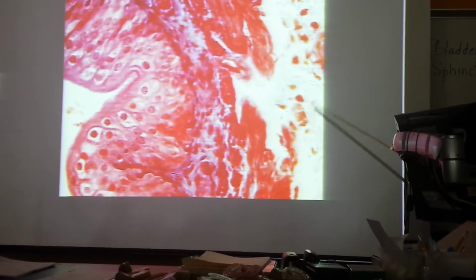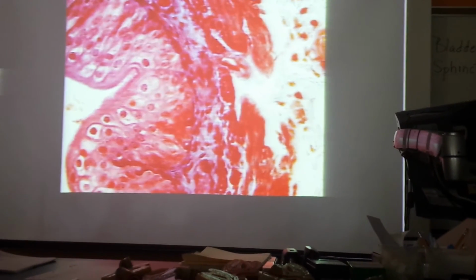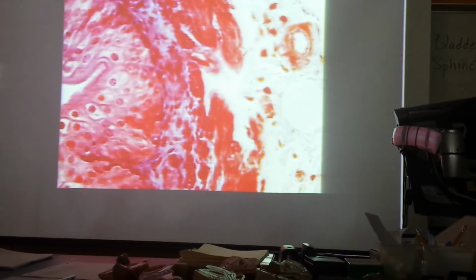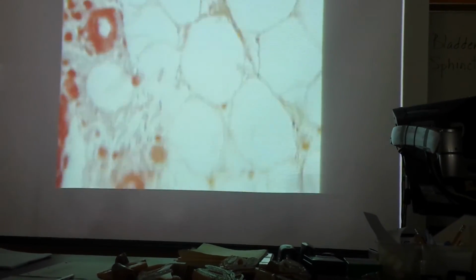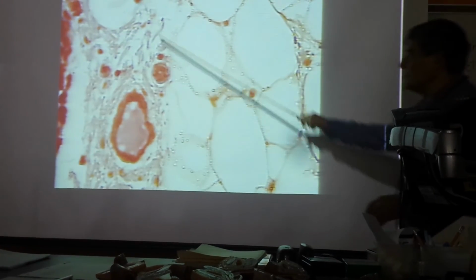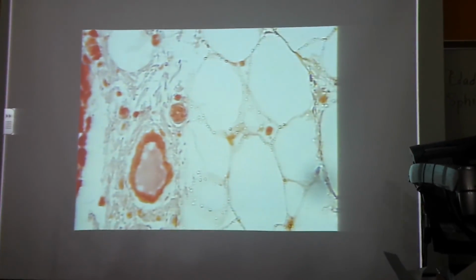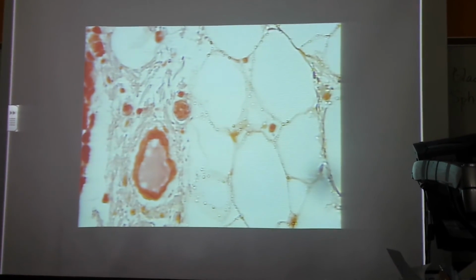Okay? And then out here, this connective tissue is adventitia. Gray area. See the blood vessels and so on. It's adventitia, and now here again, the adipose, the fatty sheath. Okay. Any questions on this?